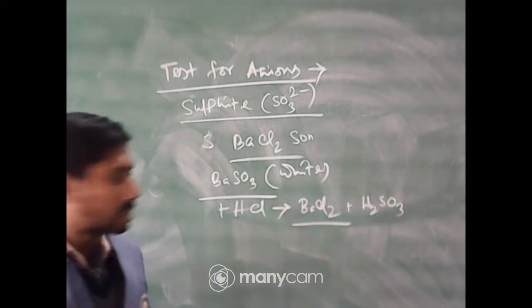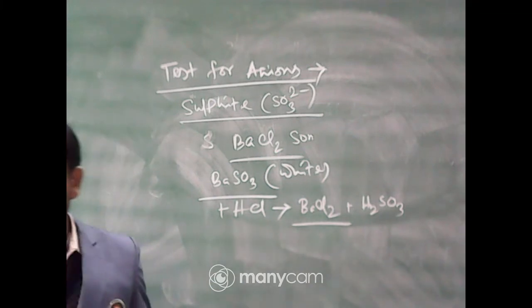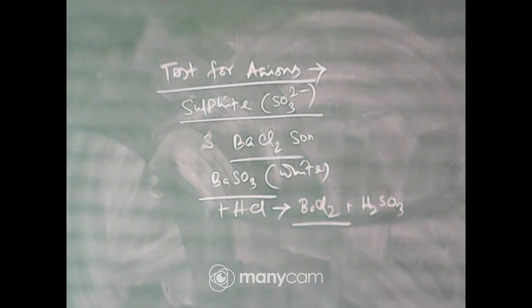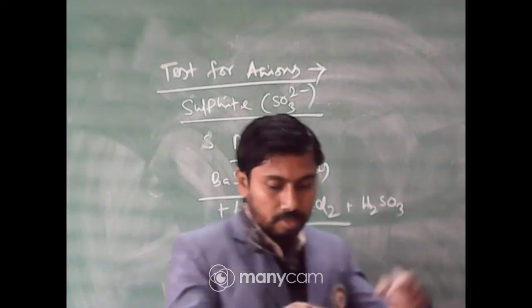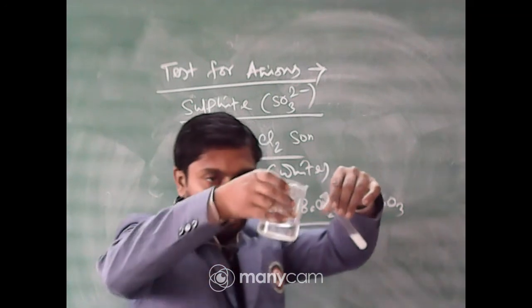So the next step is the addition of mineral acid. Now just look at this. I am adding mineral acid here.